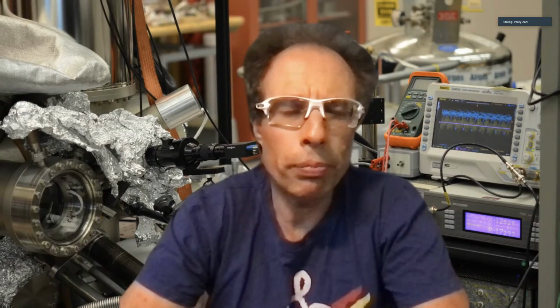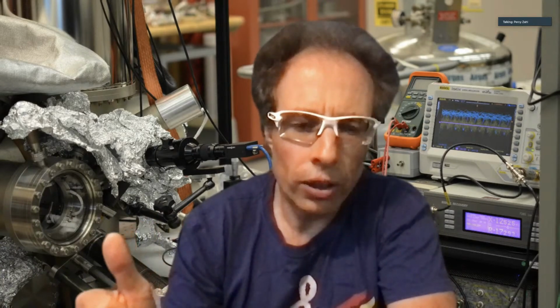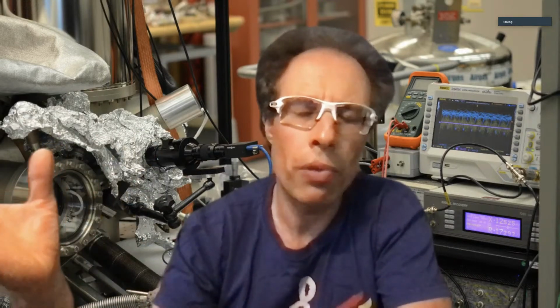So this microscope approach is actually able, if you extract a very few molecules, a tiny droplet, and put a few on the surface, I'm actually able, and a few other laboratories as well, to look at a single molecule, not as a mixture, but you see several molecules. You can pick one and look at it in all detail and see what's in there. And that's a very unique thing that I can do, which applies to a very wide range of chemistry in general.